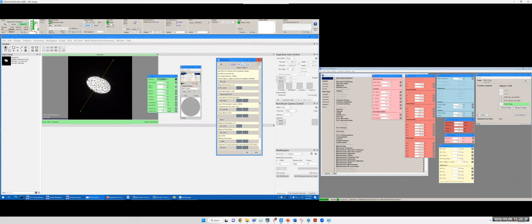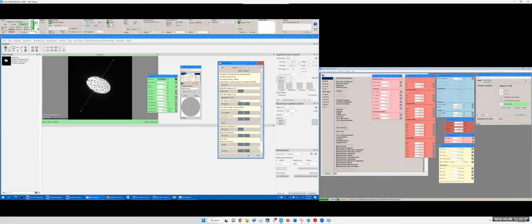Any questions? Do you know what is the criterion we are looking for in this procedure? So what we're looking for is for the field of view to not be moving along that line you've drawn. For the X, if it's moving perpendicular to that, it's okay for now since we haven't done the Y alignment. Yeah, so for this alignment, we are just aligning X. So moving along Y is okay. So, okay, we can move on. High voltage.